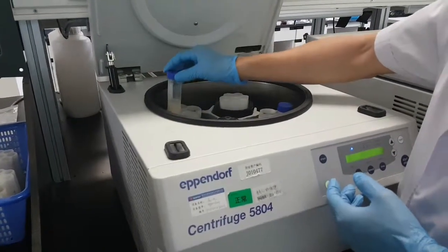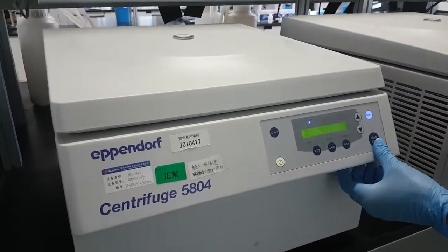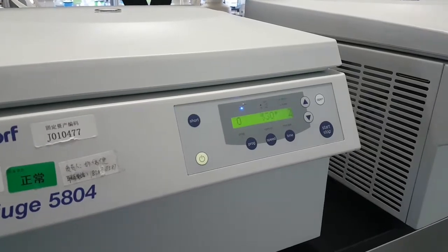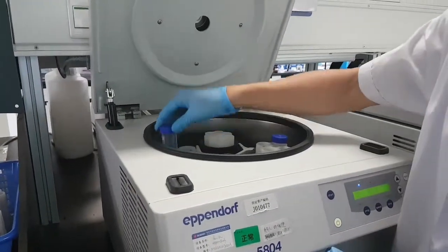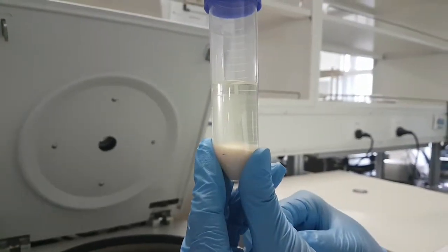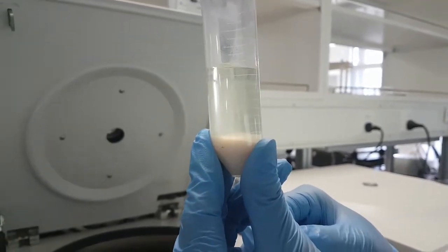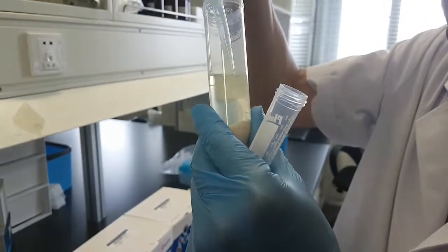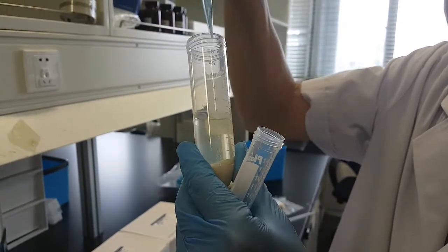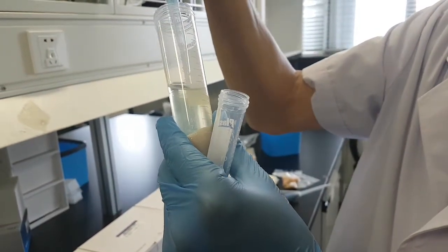All right, now we take out our sample and we can see here the supernatant very clear. Now we take two milliliters of the supernatant, only the supernatant, and put it into a 15 milliliter centrifuge tube.